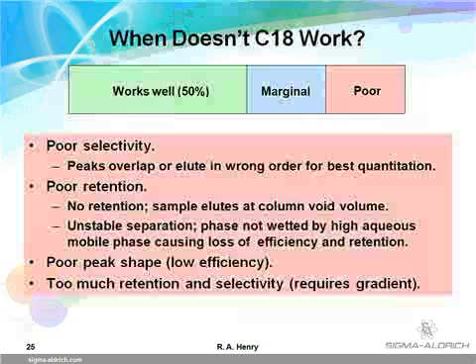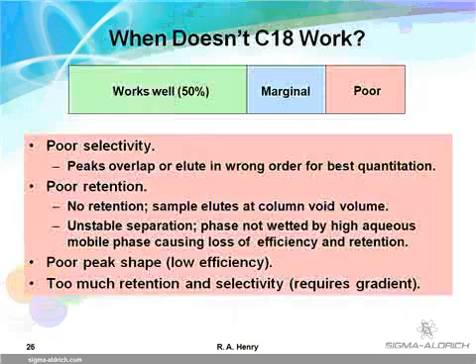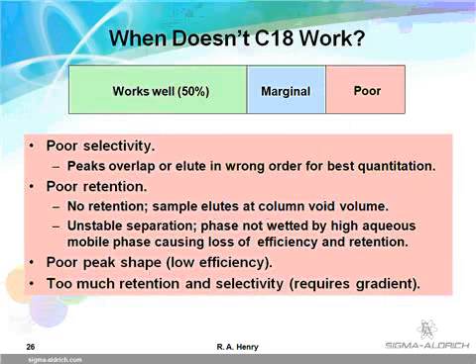C18 columns have become the industry standard as suggested in this slide. The hydrophobic interaction forces that are dispersive in nature are often sufficient to allow C18 and C8 columns to retain and separate many organic compounds. However, results may not be optimum in all cases. Trial and error has shown that selectivity, retention, and efficiency can all suffer with certain sample types.